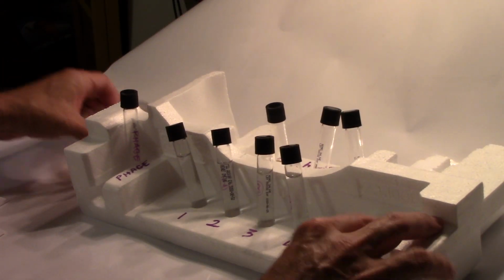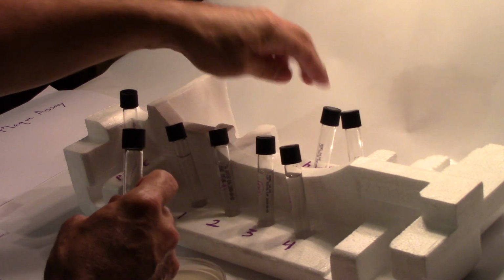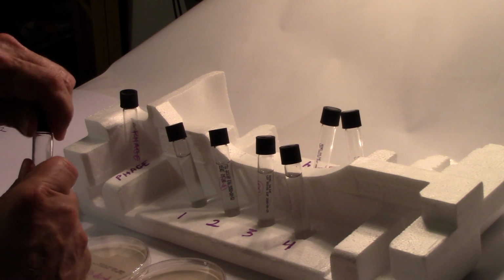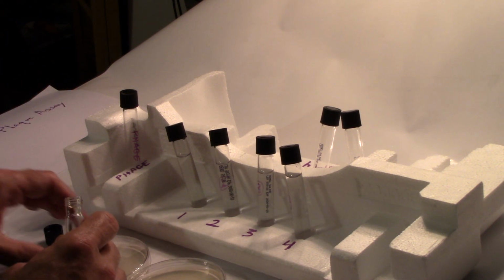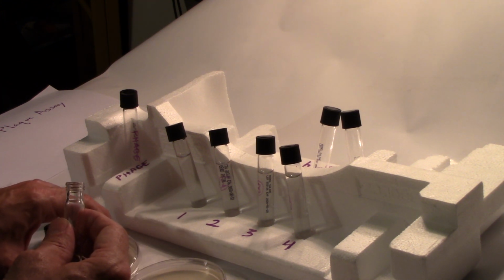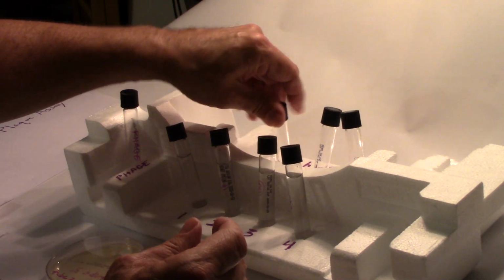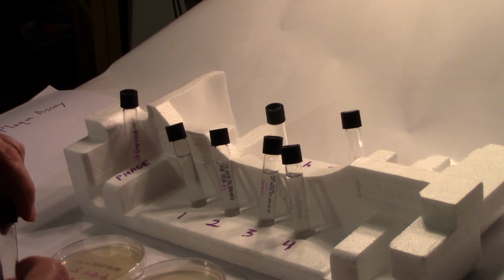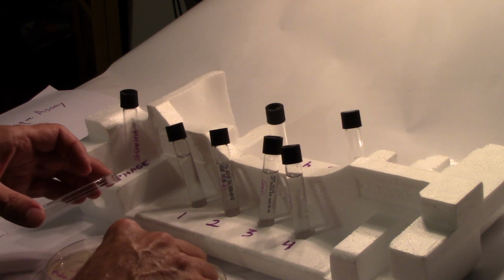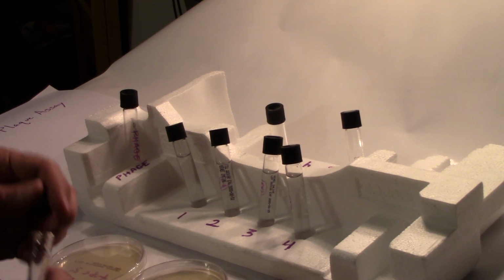Here are my plates to create a lawn. So I'm working from the back here. I'll mix it just once, although viruses, since they're like feathers in the wind, they quickly disseminate. I'm going to pour it. Pour my soft agar overlay. That's tube 2, tube 3, and then this will get a little firmer once it's been poured and once it incubates.